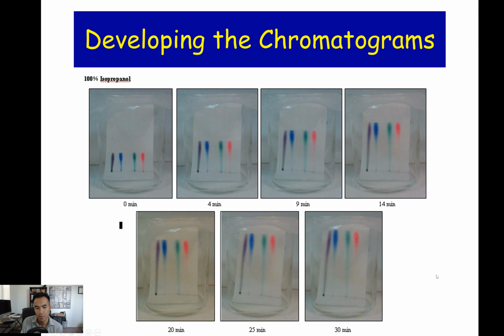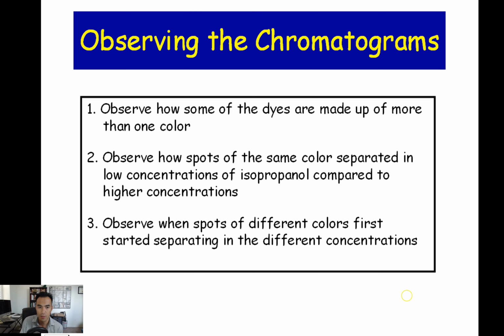So if I were to venture to guess exactly why that's happening, there could be various theories. But the most important theory has to be with the idea that as you're increasing the concentration of the solvent, there is going to be a different affinity due to the ability for that solvent to interact with the solute. And so as you're thinking about this, I want you to really hone in on the structural formulas for isopropyl alcohol and also of the mixtures.